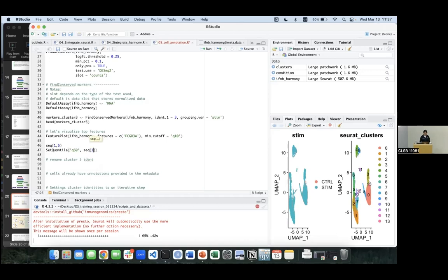So it's the 50th quantile, like half. Q10 will give you, oh, Q10 will give you 1. So this is what quantile means.